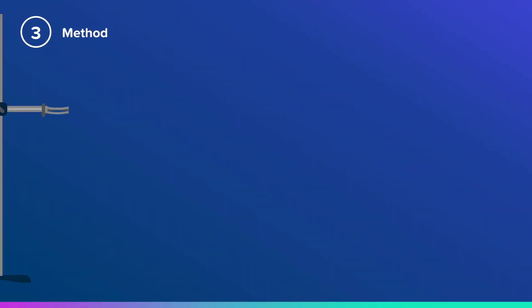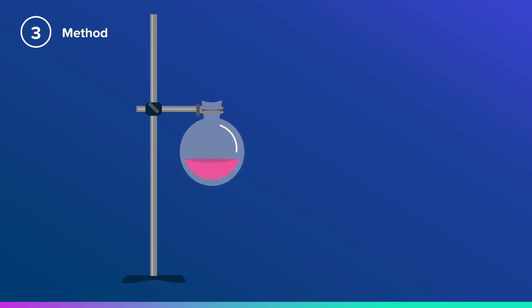Clamp your round-bottomed flask and insert the three-way adapter. Then pop your thermometer in the top of the three-way adapter.